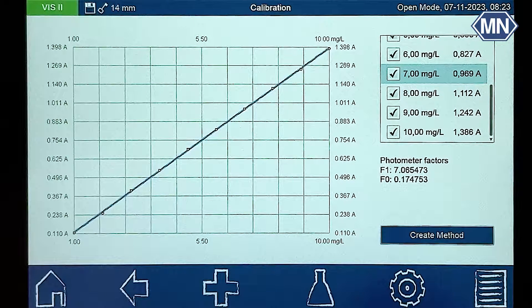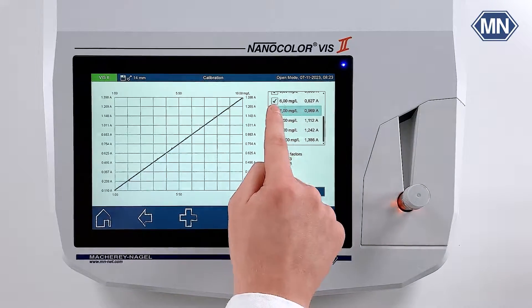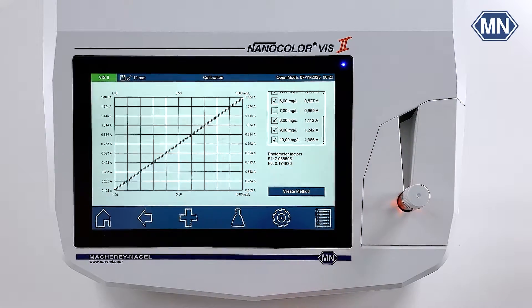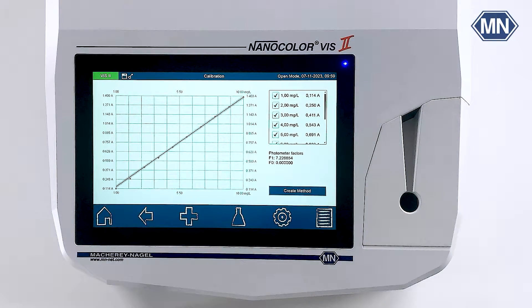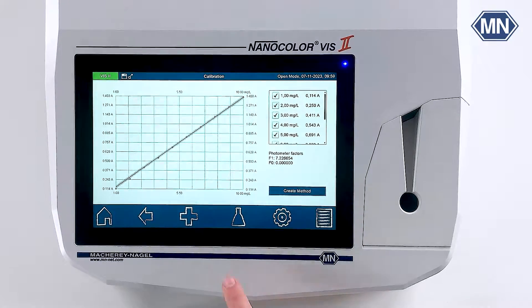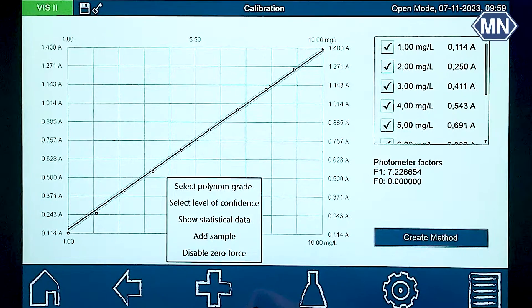If there is a data point that does not fit into the standard series, the photometer offers the possibility to remove the data point by deselecting it in the list. The method will now be recalculated and adjusted accordingly. Additional options are available via the plus button in the taskbar. If you want your calibration to pass through the zero, you can select zero force.